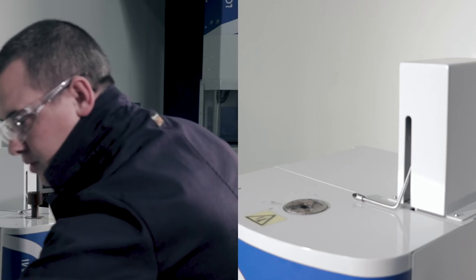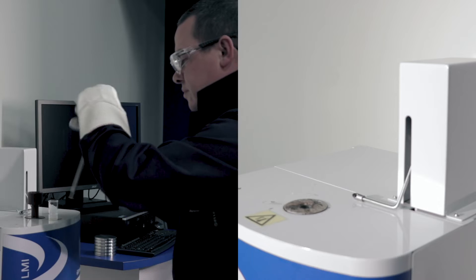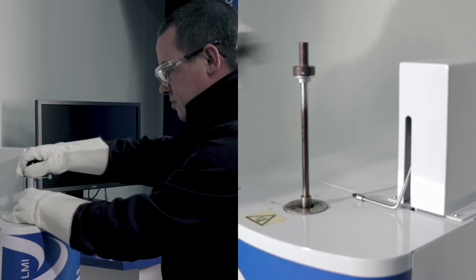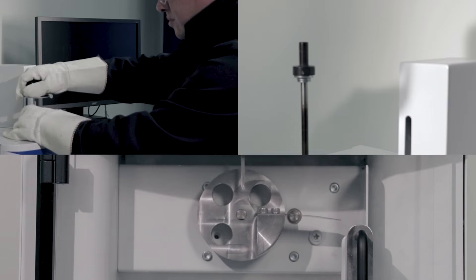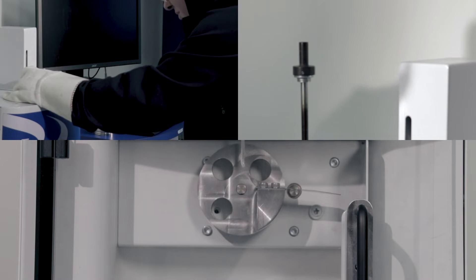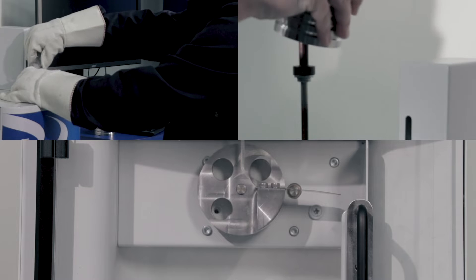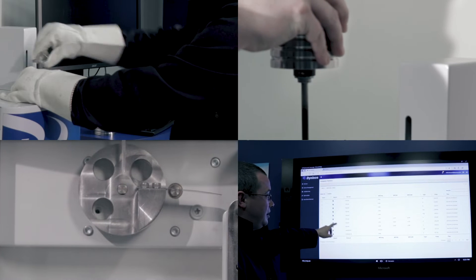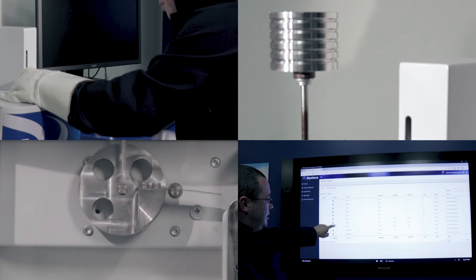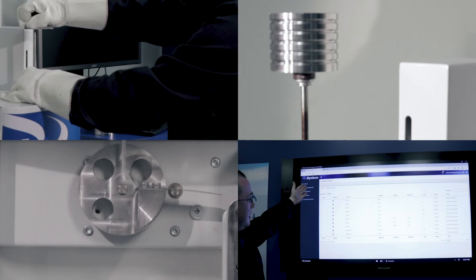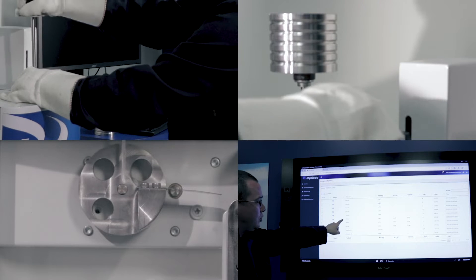This test is used to determine flow characteristics of plastic melts that are used in various plastic processing techniques, namely extrusion and injection molding. This device provides values on the melt flow rate, melt volume rate, and melt density of polymers to ensure that the conditions of production are at peak efficiency without sacrificing the quality of your products.